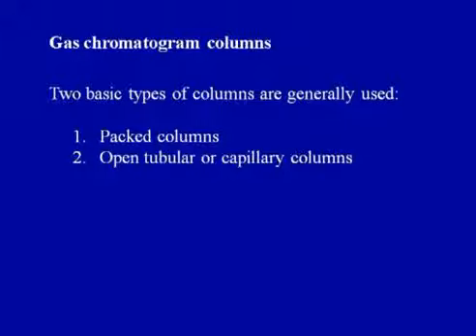So, you have to be very careful when you are utilizing an automatic sampler, and automatic samplers provide highly reproducible results, and they are much more precise. So, you can very nicely load your sample through automatic samplers. Alright, so this was about how sample injection could be done on the gas chromatographic column. Now, let us come to the next part, that is gas chromatograph columns.